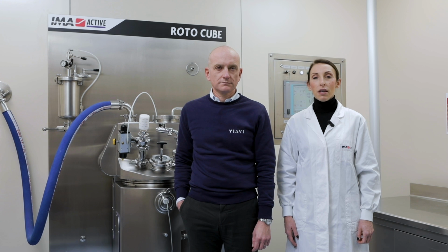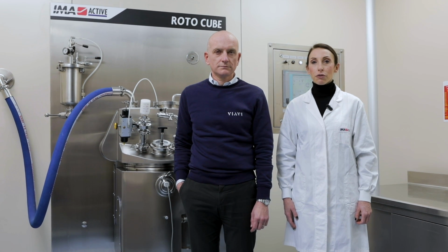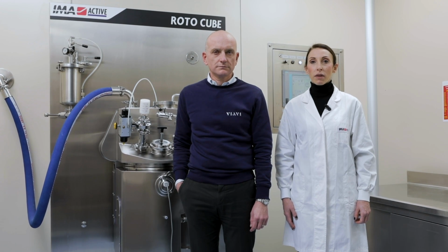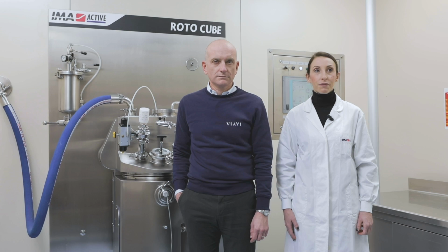One of the oldest methods for endpoint determination is based on the duration of the mixing phase for both dry and wet mixing. The limitations of this method could lead to inaccurate results due to the variability of the starting raw materials, for instance from different suppliers.